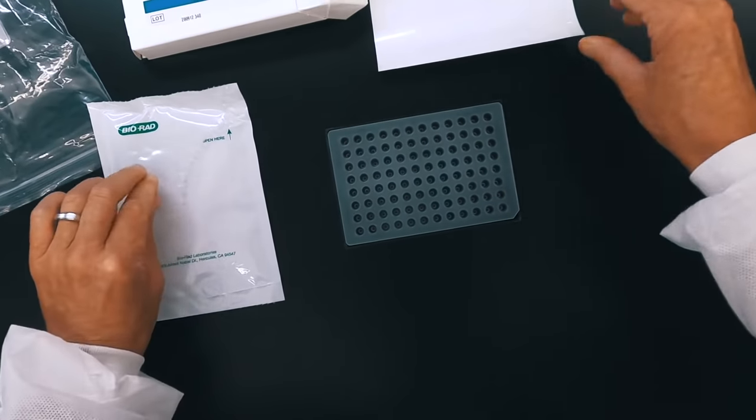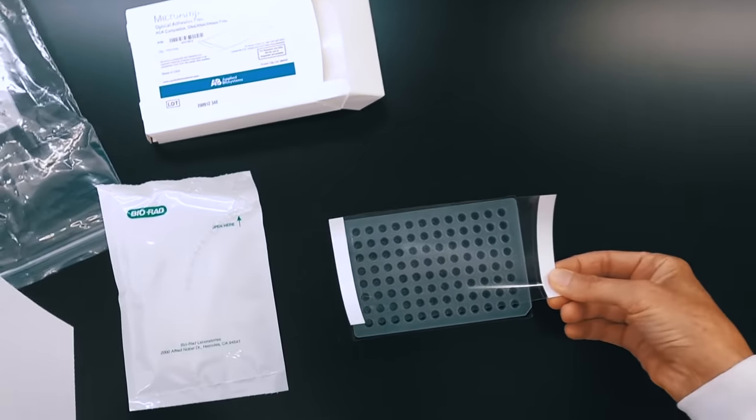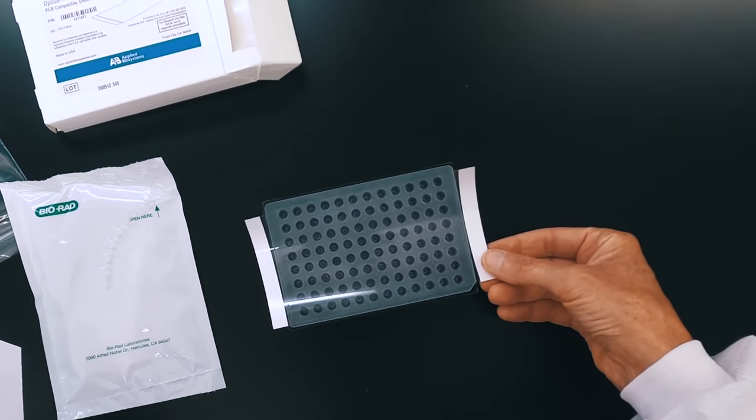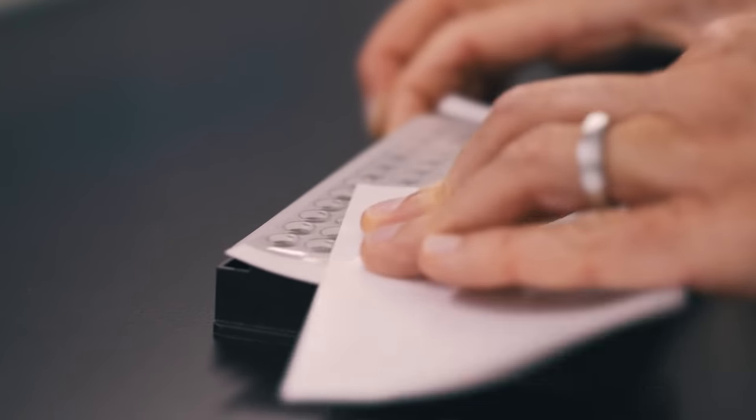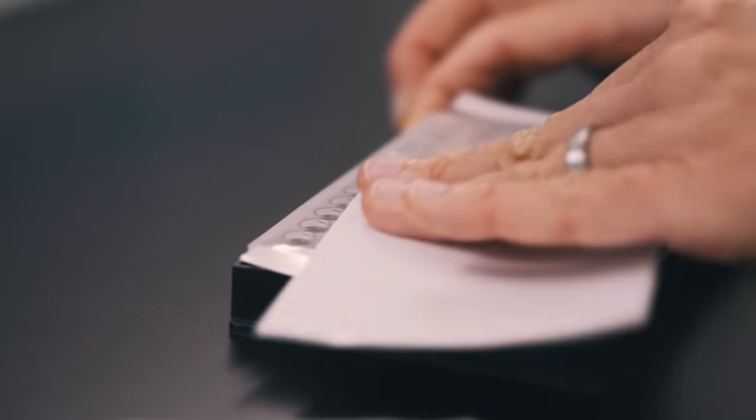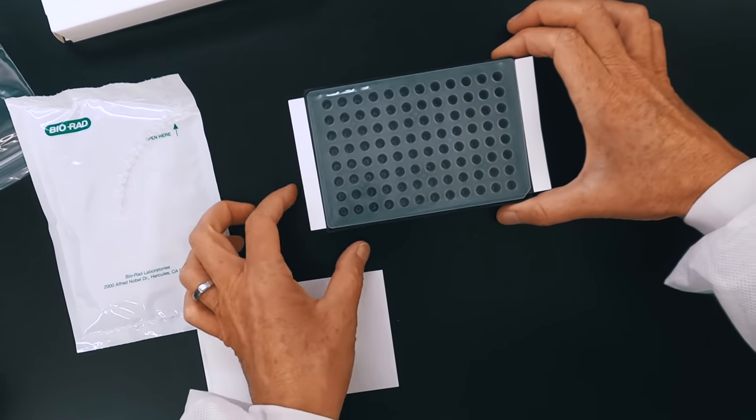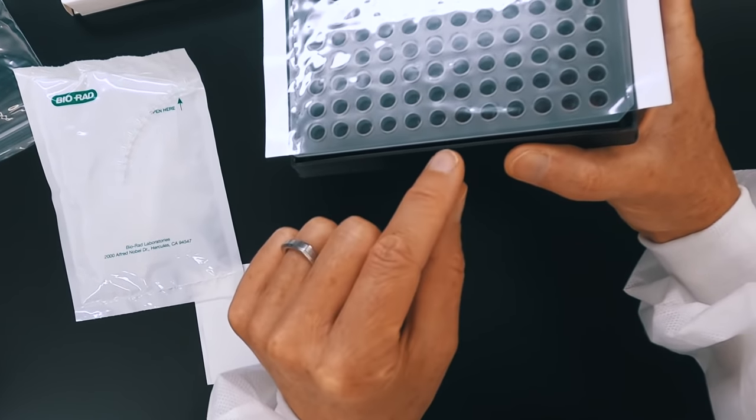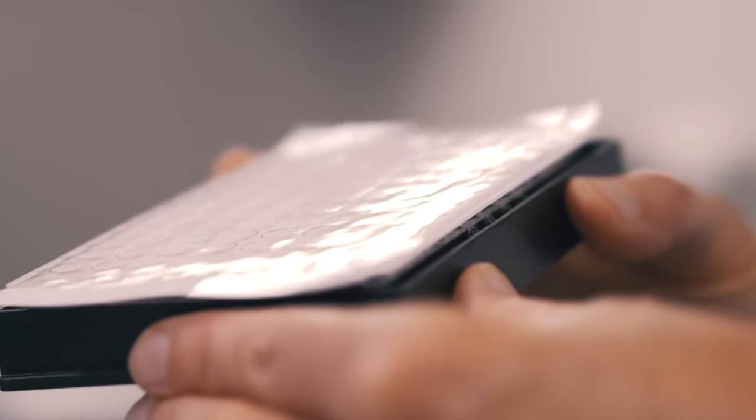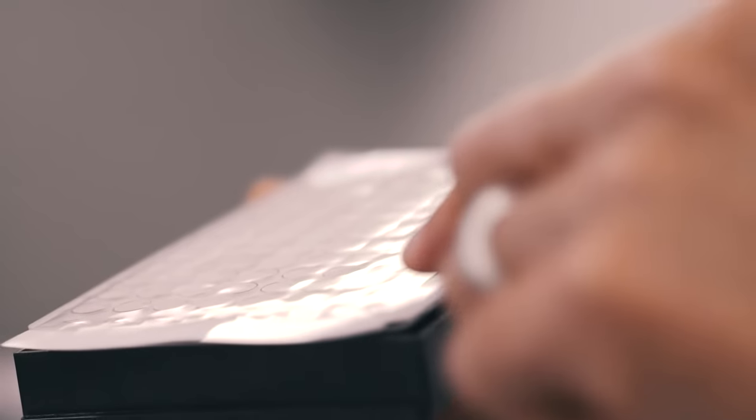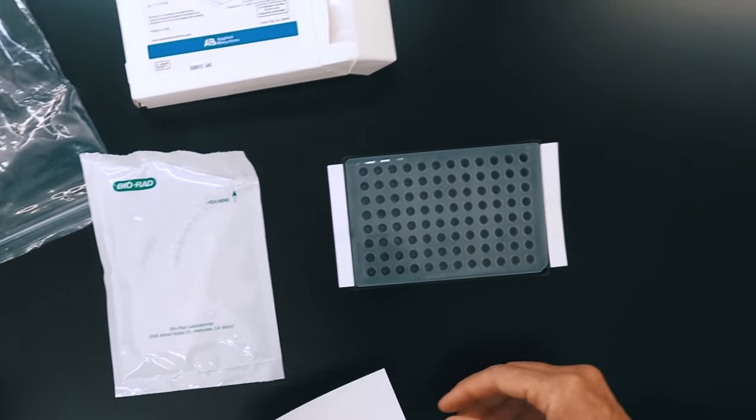The optical tapes, you want to make sure when you're adding the optical tape on that you do not touch it with your bare fingers. That's true for the optical caps as well. So I will generally use that to press it down. And then particularly go around the edges to try to get those pressed down. But you can see that sometimes the seal on the edge is not so good, so if I have to use an optical tape, I often will not use the wells that are on the edge. So I'm confined to the wells in the center. For that reason, I prefer the optical caps.